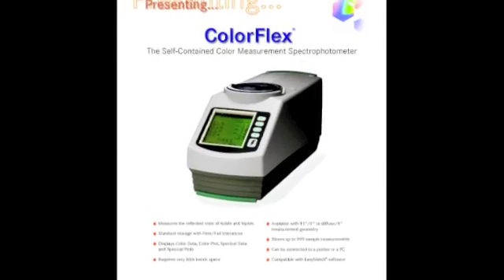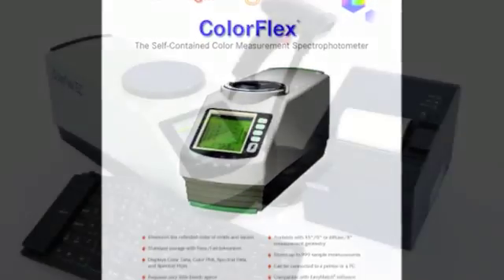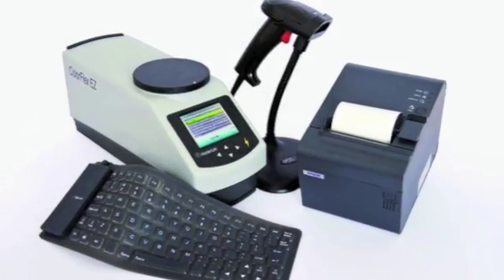Northeastern U.S. sales representative Ken Wen will now demonstrate how to use the ColorFlex EZ, a low-cost benchtop system.